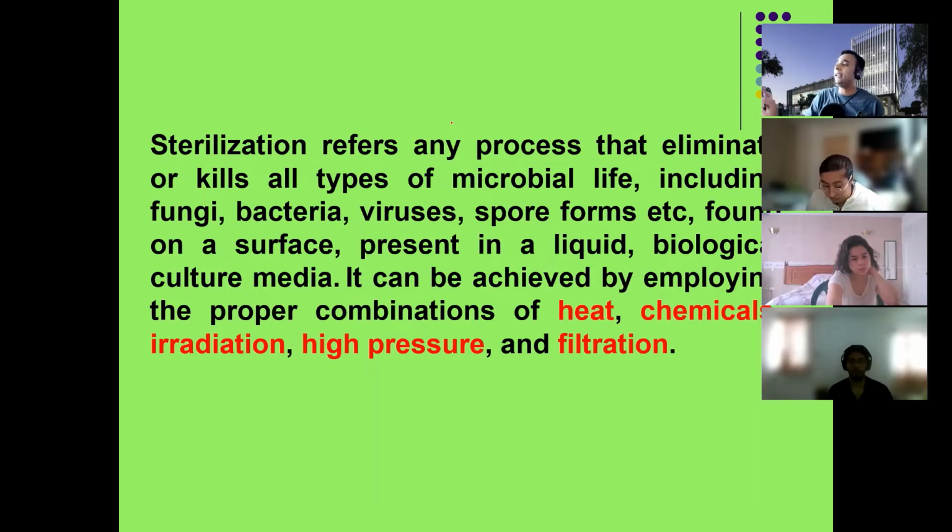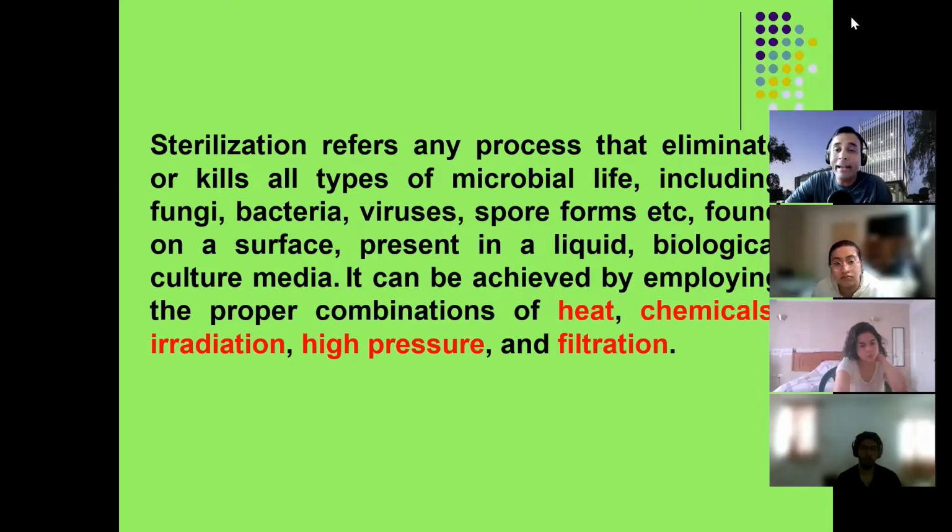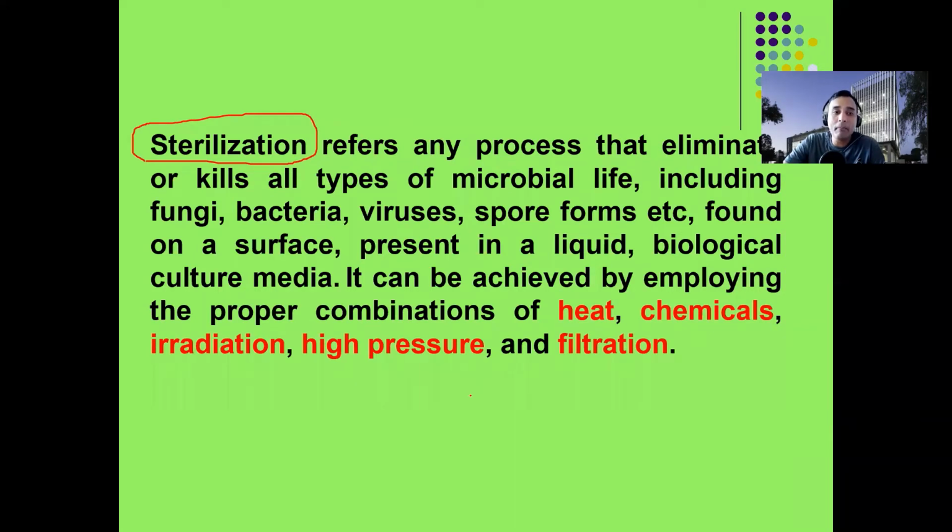So this is basically the general introduction and some examples, but the whole process of maintaining aseptic conditions does not come just from best practices, but also from some techniques. There is a technique called sterilization. Sterilization is a technique by which you can kill microorganisms in your vessels, in your flasks, in your media, whatever chemicals or materials you are going to use. Sterilization can be done by different methods. It could be by a proper combination of heat, it could be chemicals, or it could be irradiation by rays.